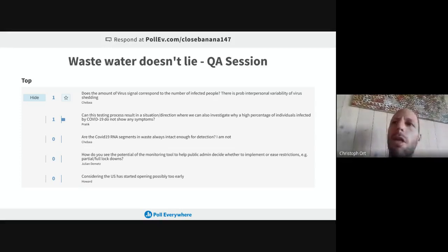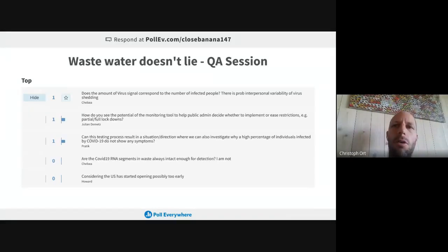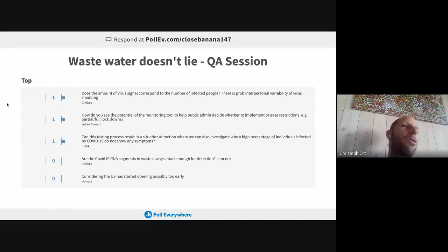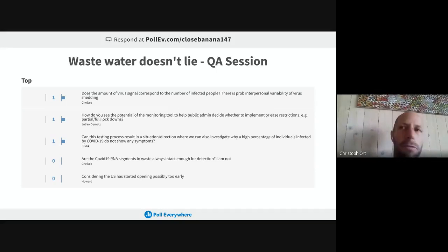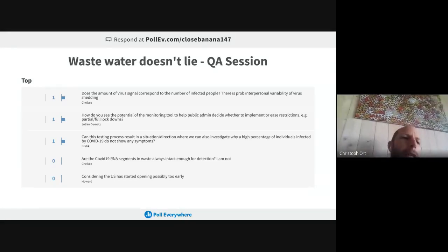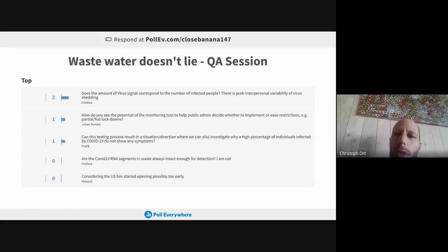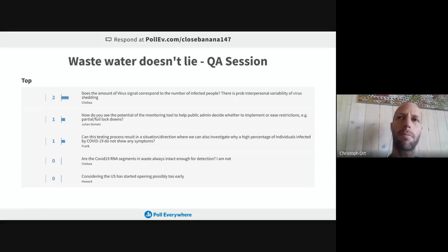We don't have to call treatment plants and explain. And they were very cooperative. I have to say almost all treatment plants we called, based on personal relationships or because of cantonal authorities, were so helpful. They really do everything they can. But next time it would be great if we just would have to press the red button, or if we analyzed one sample a month or one sample a week. As long as it's 0, 0, 0, we know it's not here. And then, as Tim explained, we would see from one week to the other, oh, now it pops up in one of the 19 or in one of the 100 treatment plants that we regularly analyze in the future, maybe.